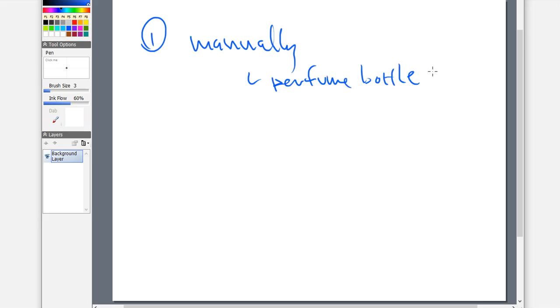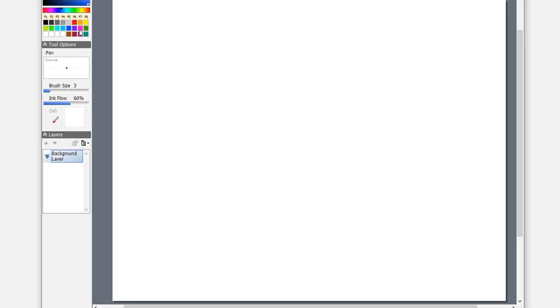So that's one way to do it. The problem is that you are kind of exposing yourself because you are coming in contact here with the liquid, with the vapor. You're spraying it on there yourself. Hopefully it's safe. Hopefully you don't breathe it in. But there is kind of a little thing here with exposure. But the good thing here is that it's very fast and very quick. So if this is something that you are after and you want no instrumentation reliability, I'm just going to spray the stuff on there myself, call it a day, go heat it, now take a look at it, then absolutely you can do that. So manually applying it is an option for users in the HPTLC arena.